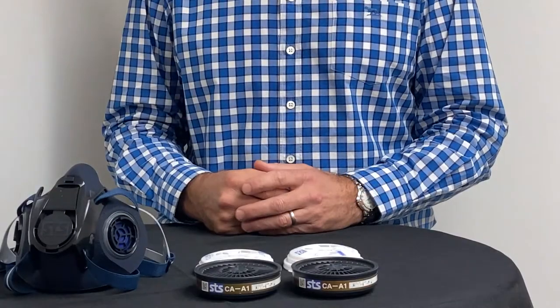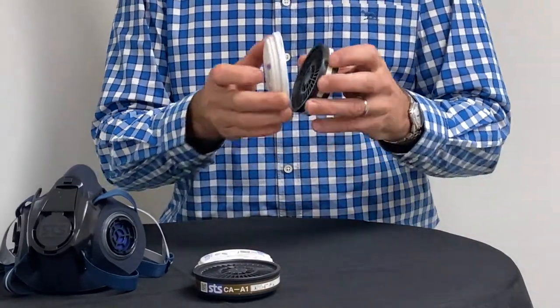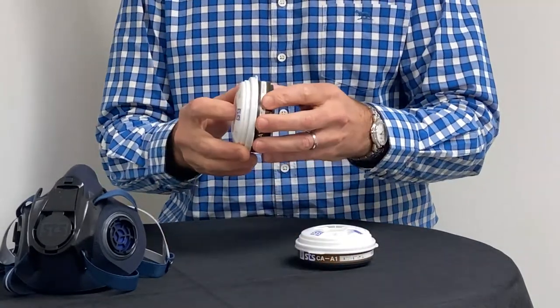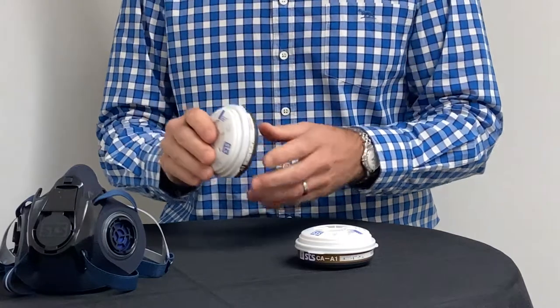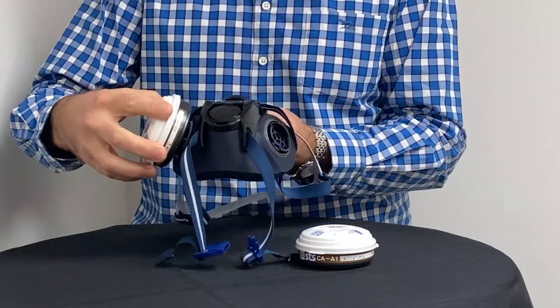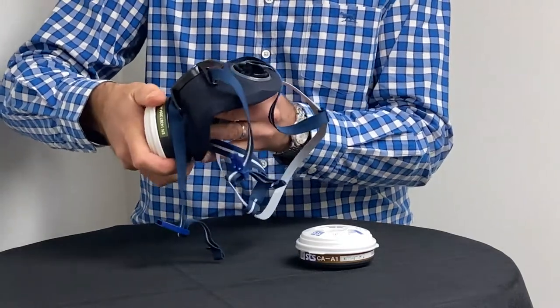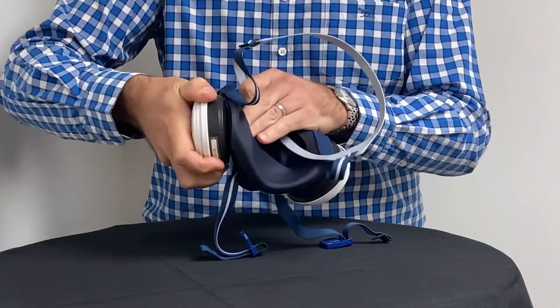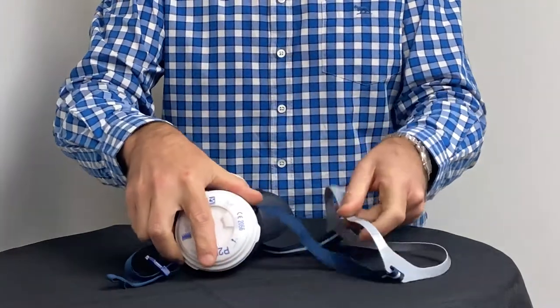The first step is to clip on the clip-on filters, if required, to the main filter. Now it is time to attach the filters to the mask. Simply line up the filters with the twist lock mechanisms on each side of the mask. Press gently while twisting clockwise until you feel them lock into place.